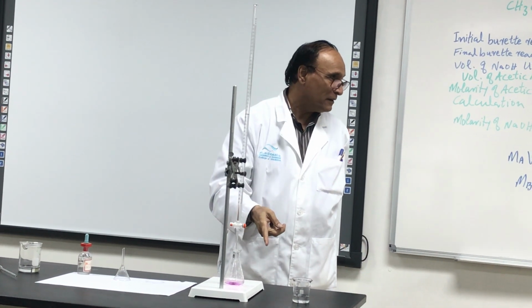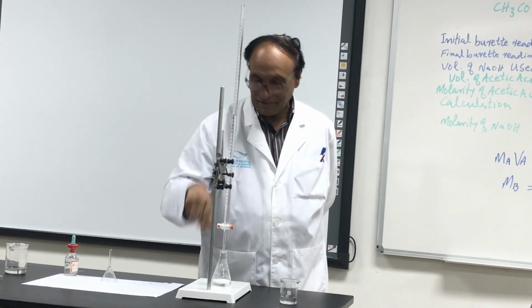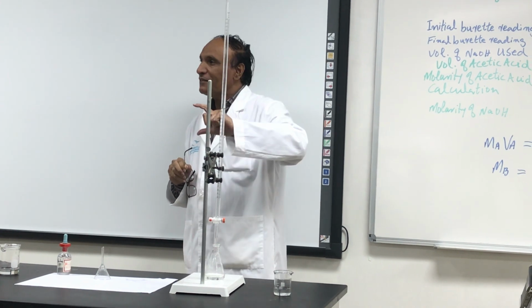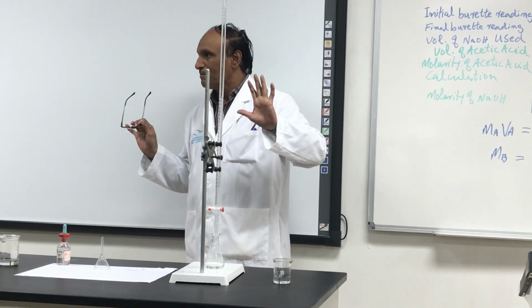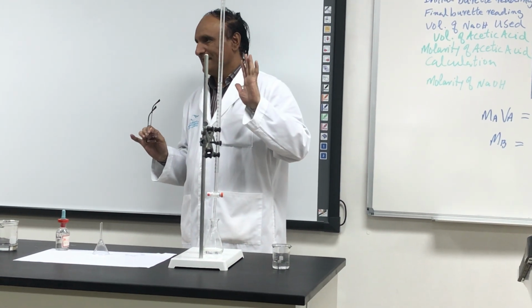Is it just one drop? No. Should I shake it now? There you go. Fifth point. So I took direct. I saved my time. Right? Did you understand? I saved my time and now I will do dropwise.